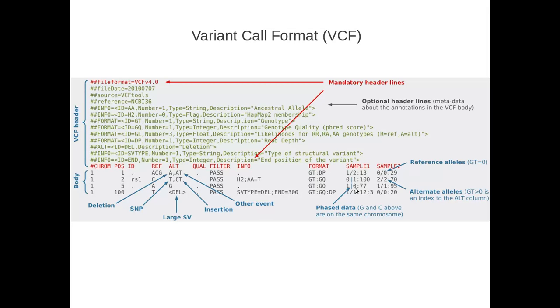So let's go over here and look at 0 and 1. Here in the genotypes, we have 1 and 0 and 1 and 1. So the point is that this 1 and 0 reflects, you can actually extrapolate what the actual allele is, based upon the ordering in which they appear in the ref and alt columns. Okay, so I think that's most of what I wanted to say about it. I think the rest is fairly straightforward.